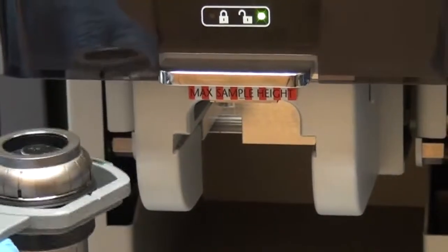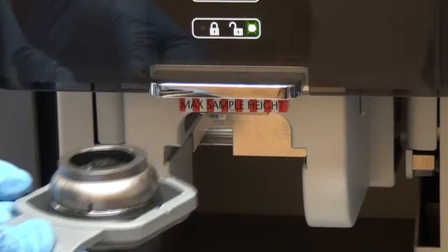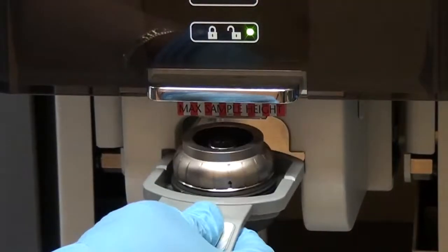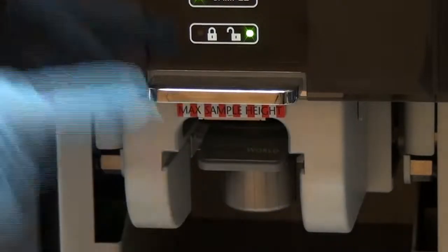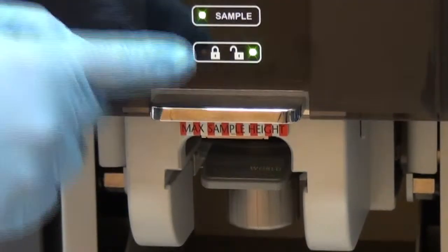The sample holder is inserted into the microscope using the grooves in the slot as the guide. It should be pushed into the slot gently until it stops by the back of the slot.